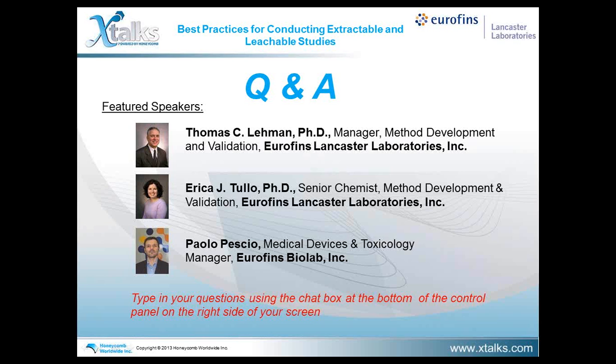On the other side, you may have a compound that was observed as an extractable that is a leachable, but once it comes in contact with the product itself, the product matrix, there could be other interactions that could lead to secondary formations of structures. It could be breakdown, it could be interaction and some kind of reaction between components leading to new species that were not observed during the extractable study.